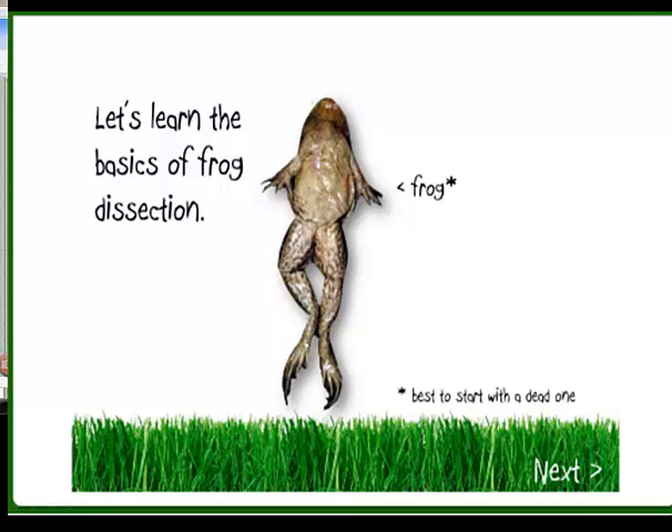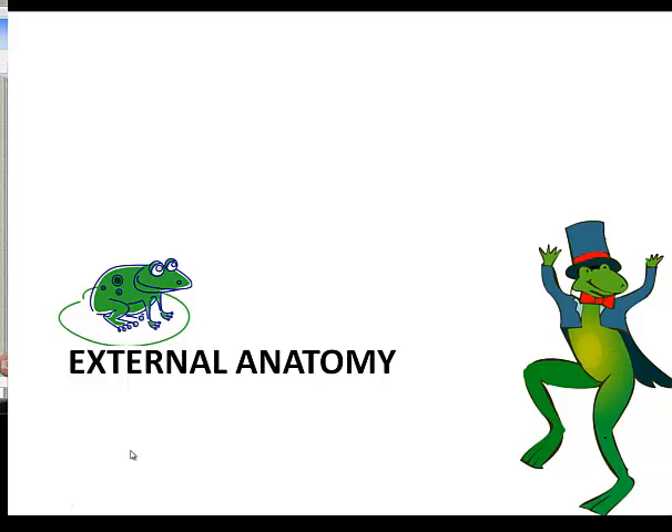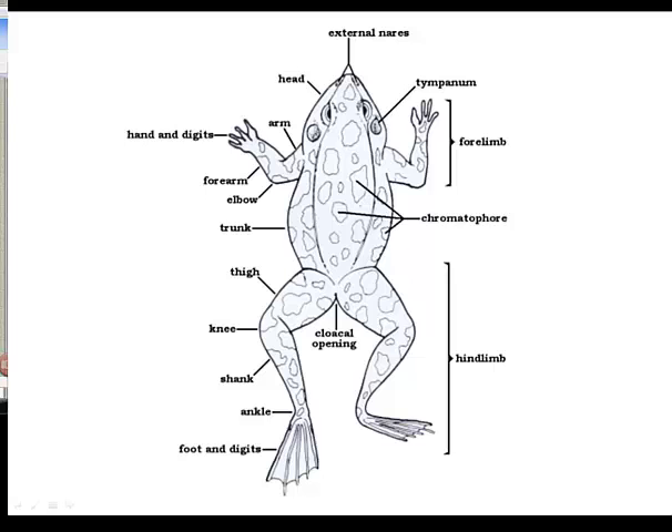We're going to start the frog dissection, and we're going to look specifically today only at external anatomy. So the external anatomy is all that you're going to have to worry about getting through. When we talk about the frog and the external anatomy, this is going to be the dorsal view of the frog.